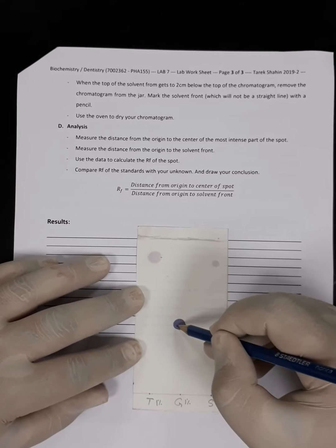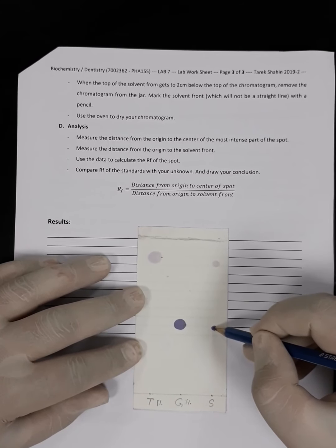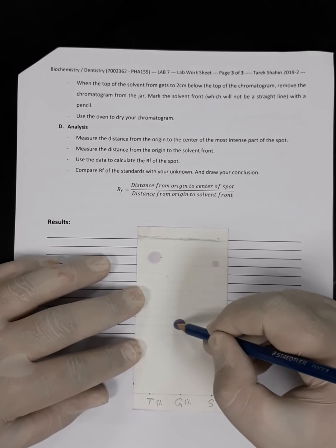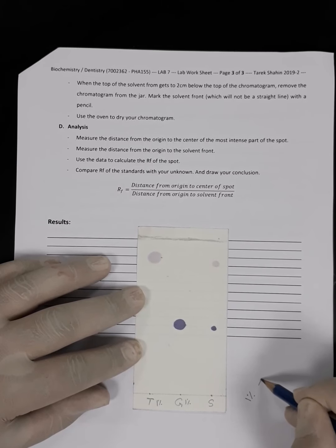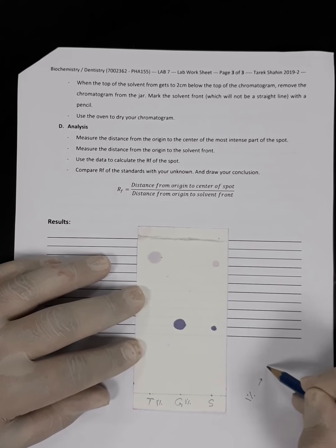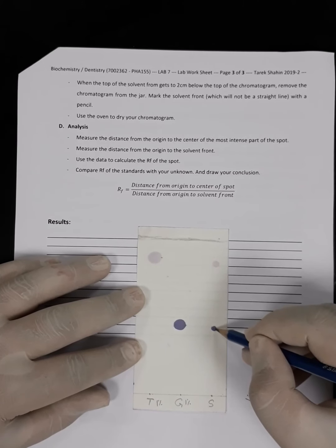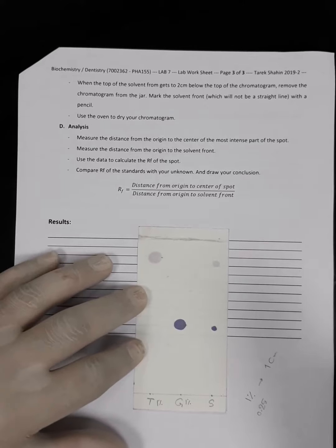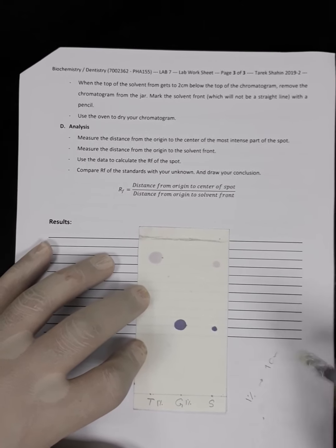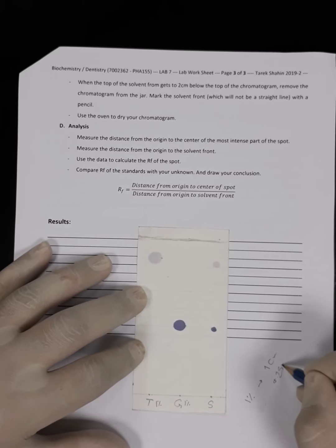Simply, we will find out the diameter of that circle, and we will find out the diameter of that circle. And then we will say, let's say the diameter of that one was 1 centimeter. So we will say 1% will give us a circle of 1 centimeter diameter. If we measure the diameter of that circle, let's say it would be 0.25 centimeter.